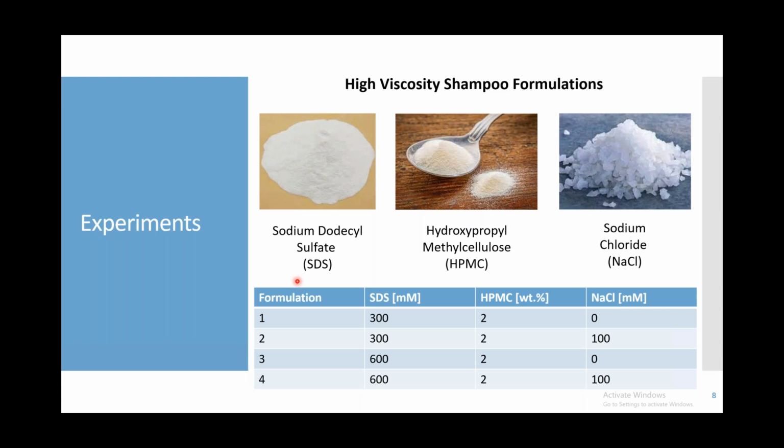And we made these formulations by mixing these three ingredients shown here. So the first one is an anionic, negatively charged surfactant, SDS. This is the cleaning agent. This serves to clean oils, dirt, solubilize fat, and remove it.